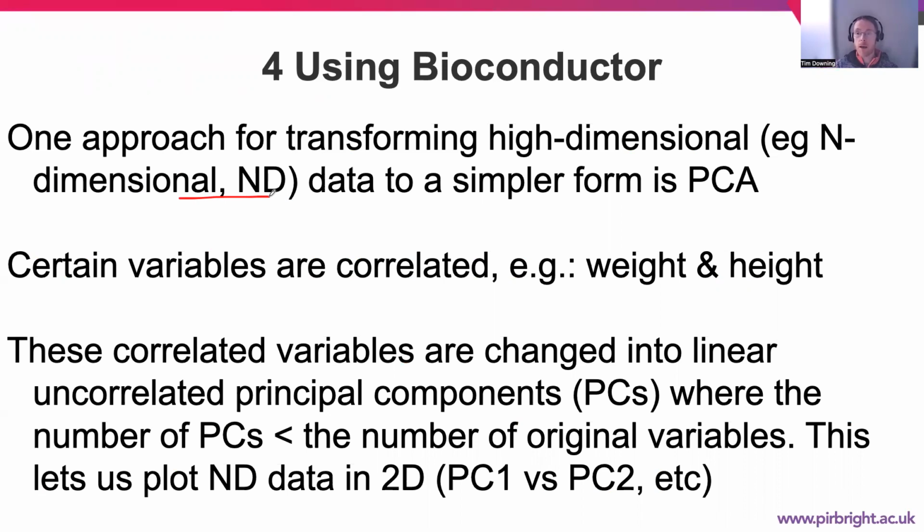If sites A and B have an identical pattern, that they only vary in the same set of samples, then sites A and B are effectively the same for all purposes. So we see segments that have a similar phylogenetic pattern and other segments that have a different phylogenetic pattern. And if we look at those patterns across the whole sequence, we can allocate them to different correlated variables.